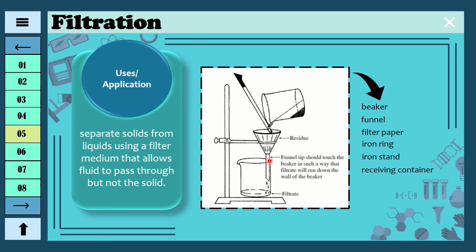So, relating this one to the decantation, the liquid is supernatant. But if it's filtration, the liquid will be filtrate. Relating also the solid particles in the decantation, we call that sediment or precipitate, while in the filtration, we call that residue.